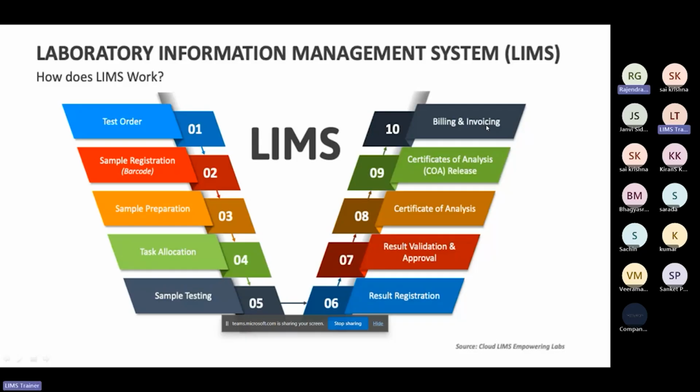If I consider a hospital, or some companies giving some samples for analysis to another company, then this full flow will be there. Not only for hospital: if some companies give samples for analysis to another company, then there will also be a test order, and also there will be billing and invoicing. Got it? Yes, sir. Any other question?